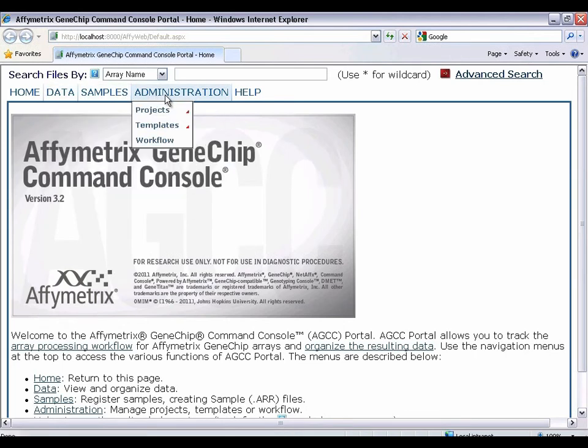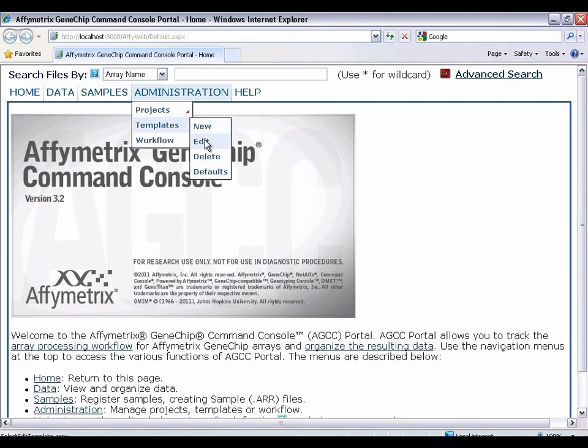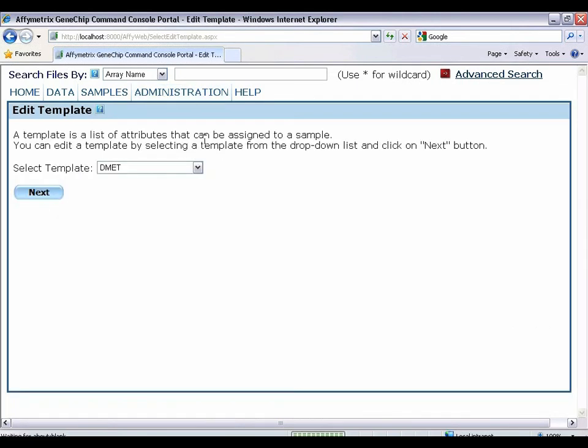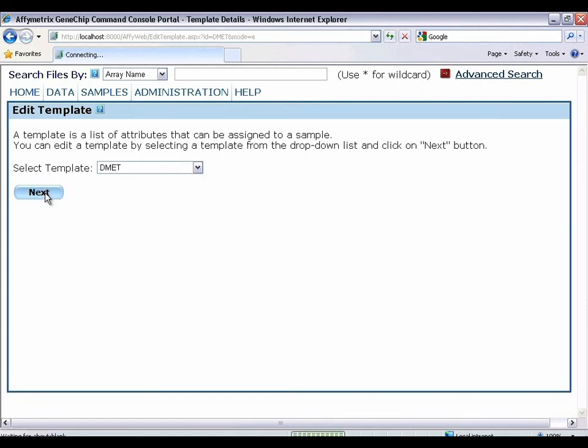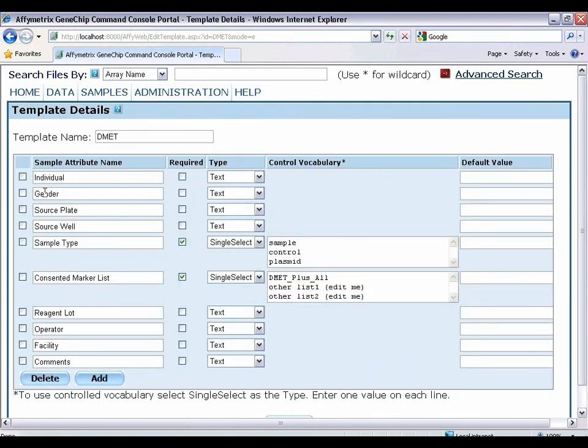First, let's check to see whether we have our DMET plus template. Looks like we do. You'll notice that it has several sample attribute fields, including a few that are required. And this is actually why you need to register your samples before you scan your chips.